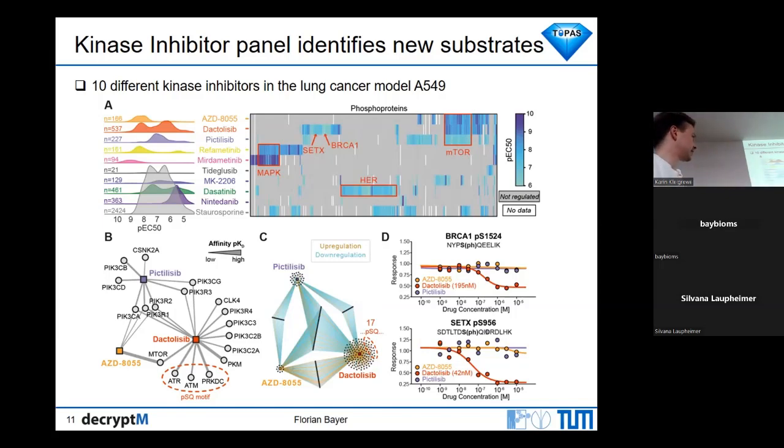And then there's something we found in general that's very interesting, in my opinion: these phosphosite numbers tend to be very, very low. If we look at the entire phosphoproteome, then it's maybe 1 or 2% of the phosphoproteome that's actually regulated and doing the job. And this is, I think, quite surprising, especially for some of these inhibitors that are thought to be kind of dirty drugs, but in fact, on the phosphoproteome in a specific cell line, they're still in this lower number.